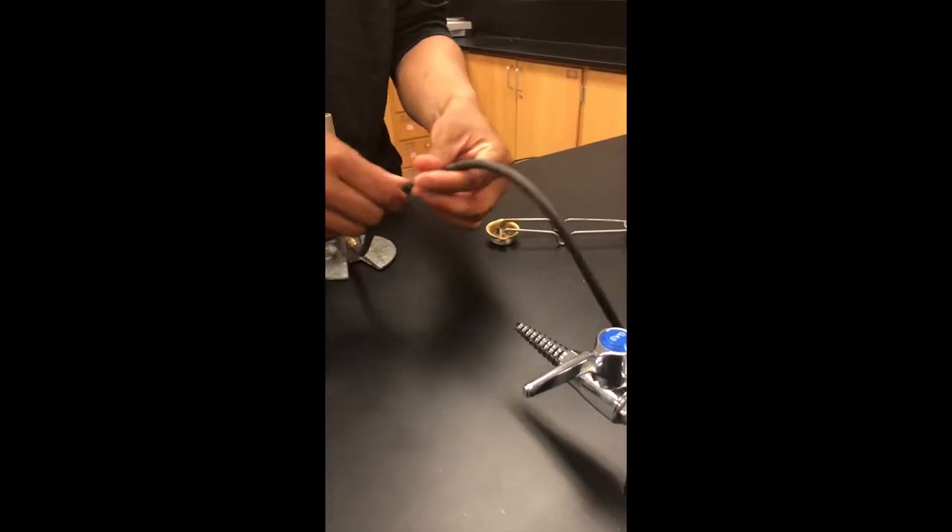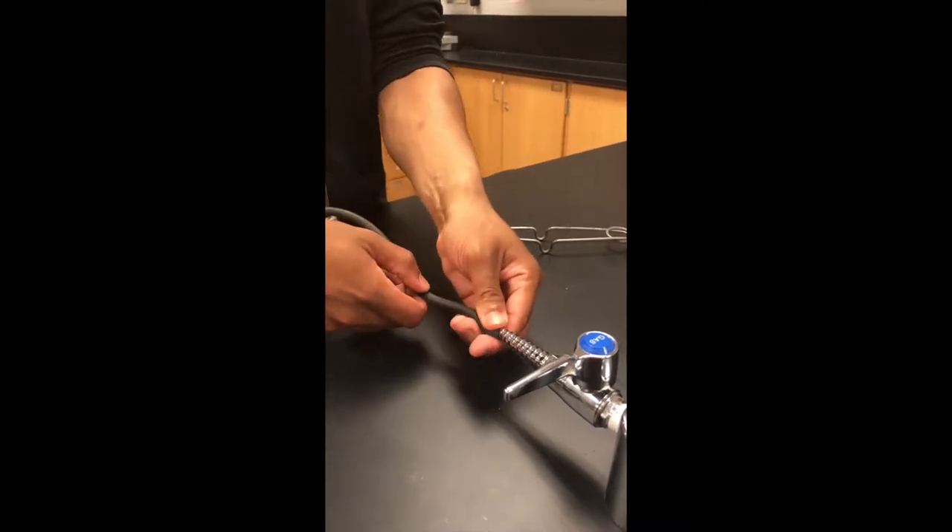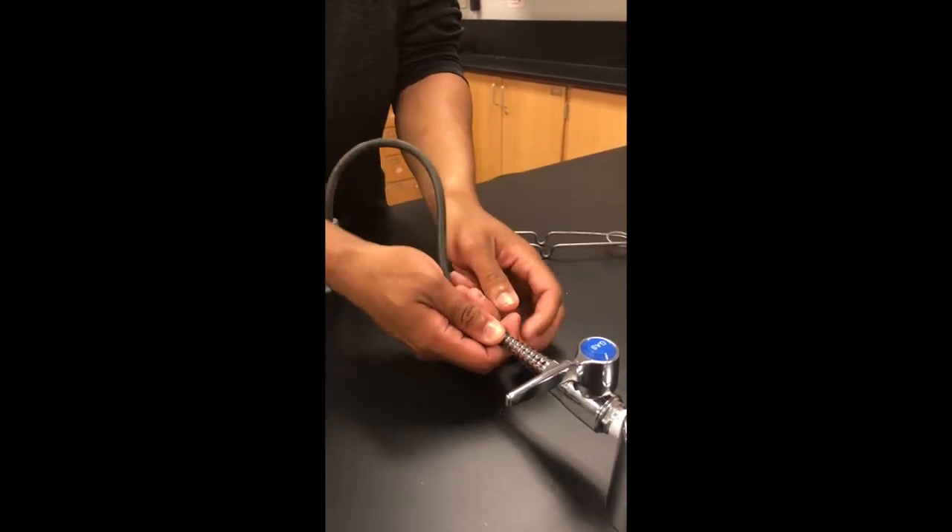First, grab the black rubber tubing and check for holes. Then, apply the side that is not connected to anything to the gas valve.